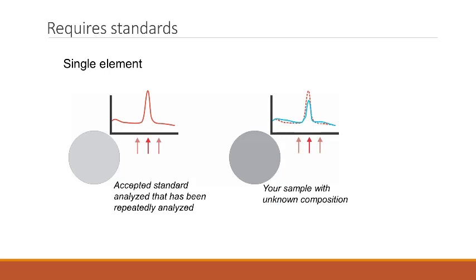What we are characterizing in this technique is the fluoresced X-rays from the sample at the wavelengths appropriate for the atoms that are in the sample. So it requires looking at the spectra of energy that are released from the sample in the form of X-rays. The technique that works best for quantification is the resolving of specific peaks. This is known as wavelength dispersive spectrometry. That is, characterizing the peak height over background so that we understand the nature of the intensity that's being released by a specific characteristic radiation. Usually the strongest one, but sometimes other ones are necessary.